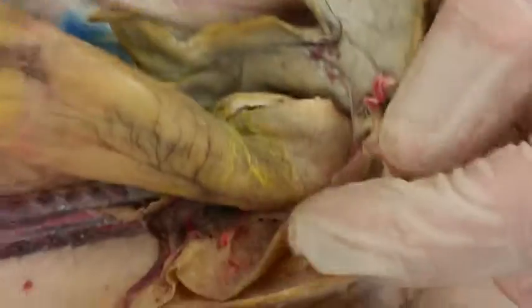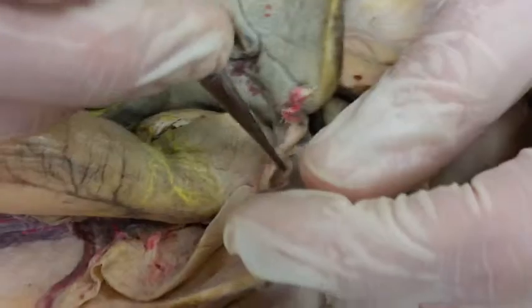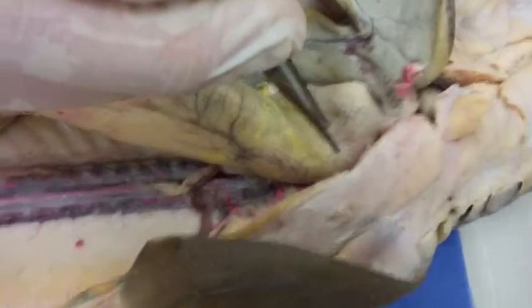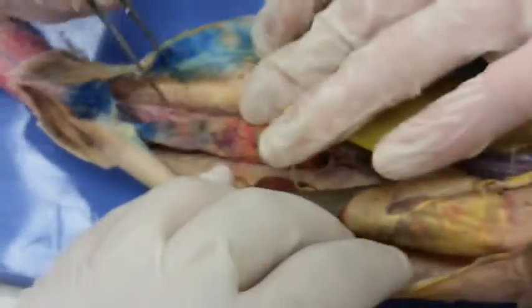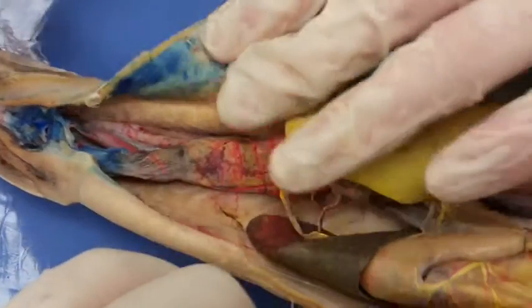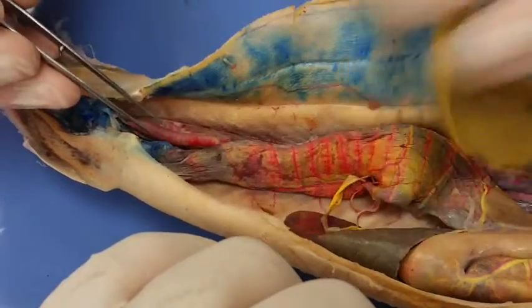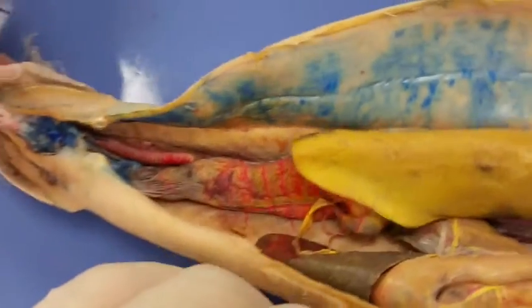Way up here, kind of tough to see in ours, but we also have the ostium tubae, which just are what lead down into the ovaries. The cortex is the outer bit. The medulla is the inner bit. Then, once again, we have kidney, rectal gland right there. Again, giant penis-like thing. And that finishes up our shark.